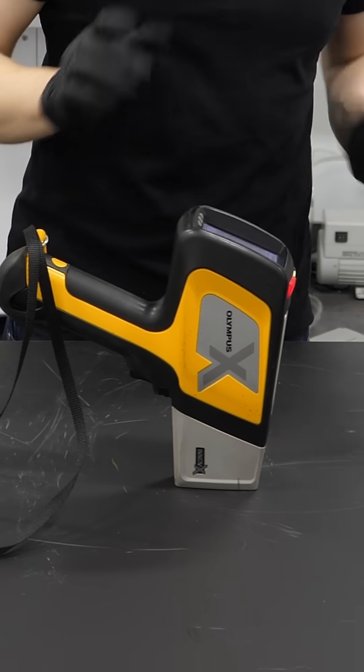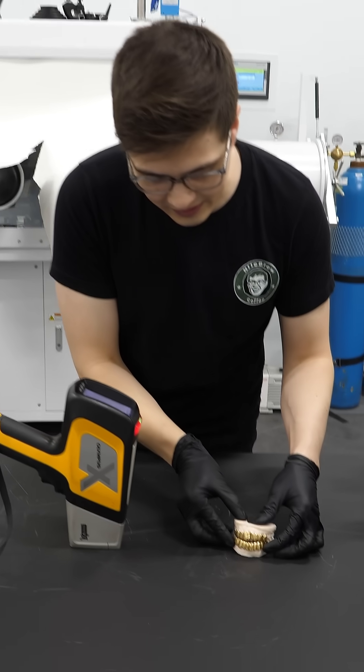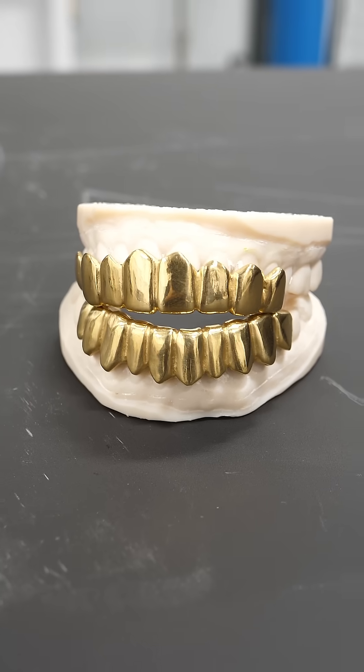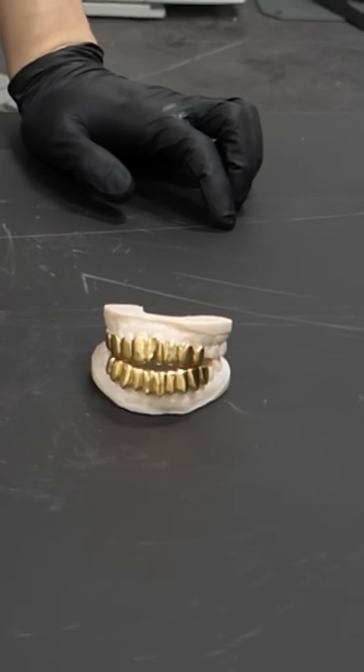For the next test, I want to try these beautiful grills that we made a while ago. Based on our math, we believed that they were 18 karat, but I want to verify that's actually true.